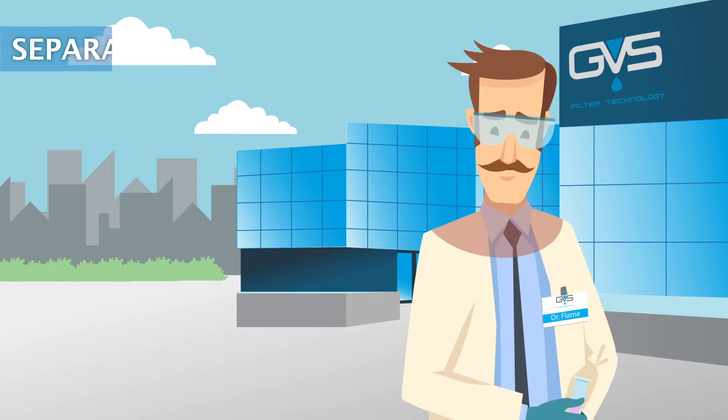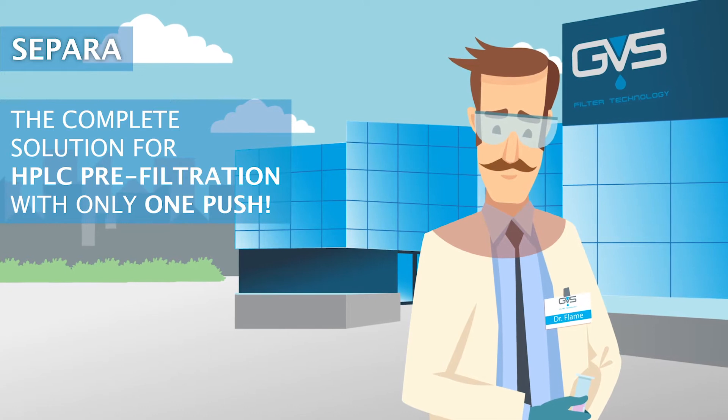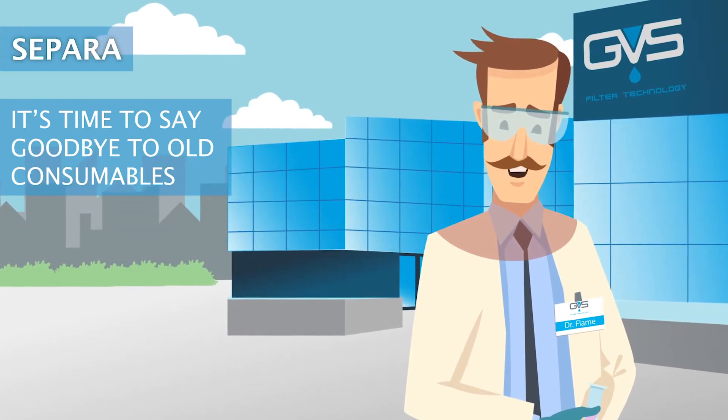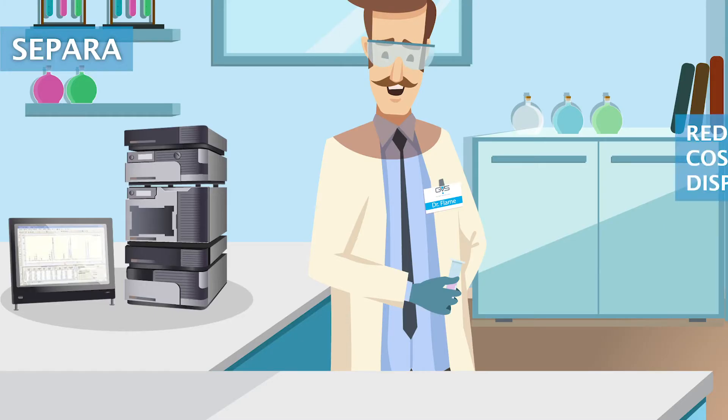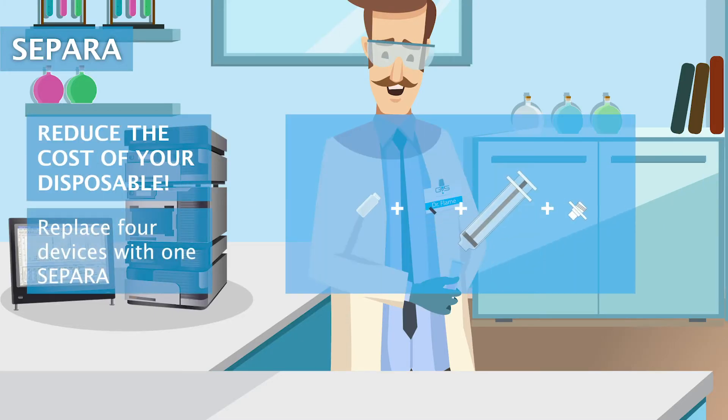SEPARA filter vials — the complete solution for HPLC pre-filtration with only one push. It's time to say goodbye to old consumables. Reduce the cost of your disposables and replace four devices with one SEPARA.